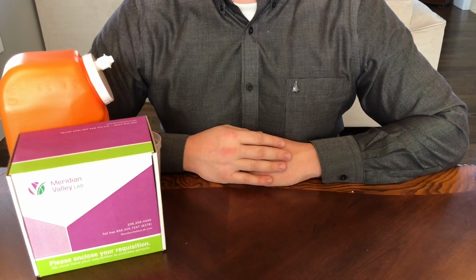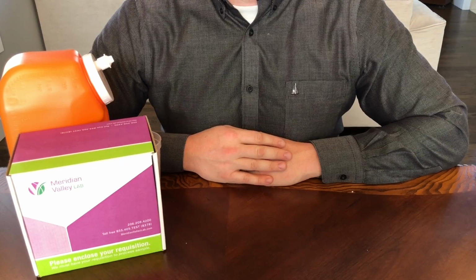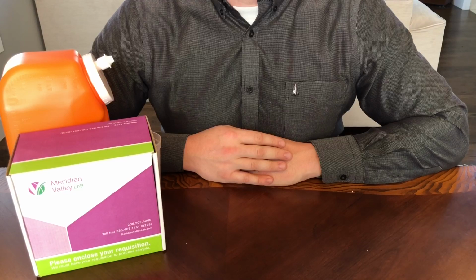This is the instructional video for the 24-hour urine hormone test. Please follow the instructions closely to ensure the most accurate results. Before starting collection, review all the collection instructions.